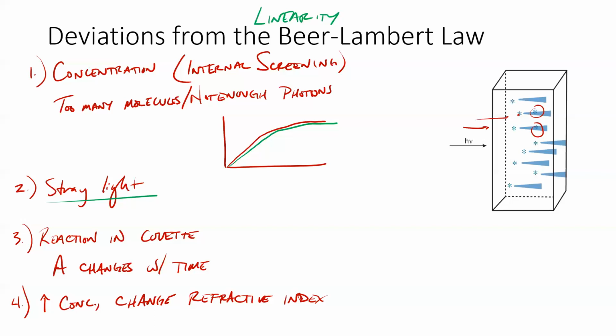It's really kind of thick and viscous relative to water, right? Because it's 98% H2SO4. It doesn't take a whole lot of water to get it to dissolve. And so it's a very viscous liquid and has a very different refractive index than water due to that, right? So as we increase concentrations, that refractive index can change and change the amount of light that's being bounced back that we're losing due to those surface reflections.